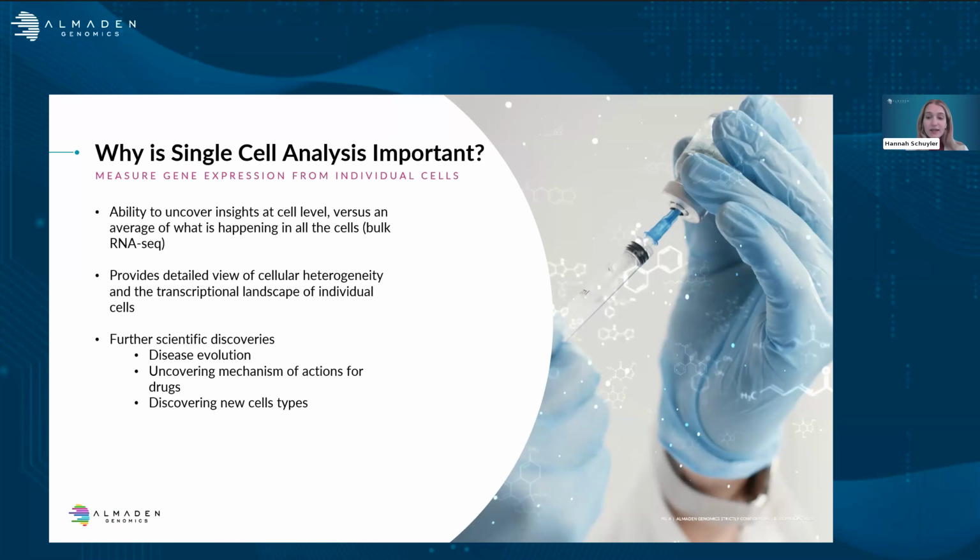And then lastly, single-cell analysis has really been critical in furthering scientific discoveries. Some of those may include how to predict how a disease may evolve over time, uncovering the mechanism of action for different drugs, or even discovering new cell types.